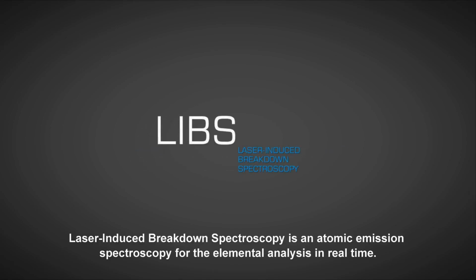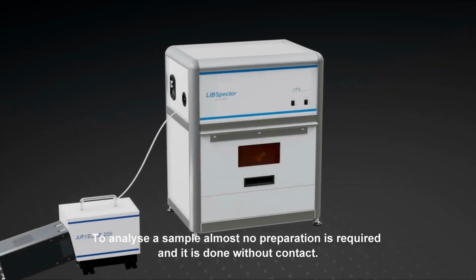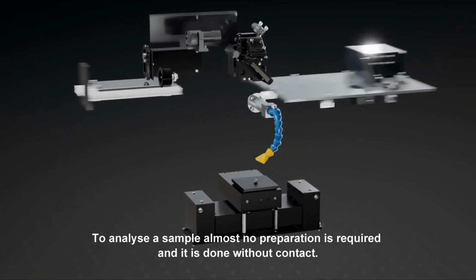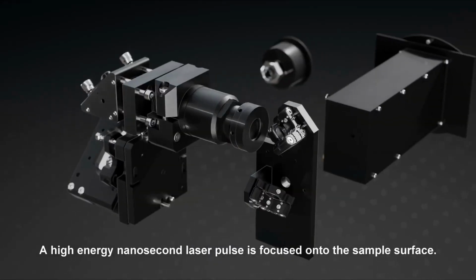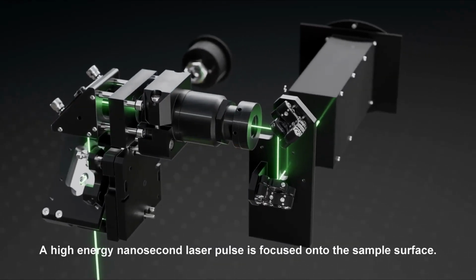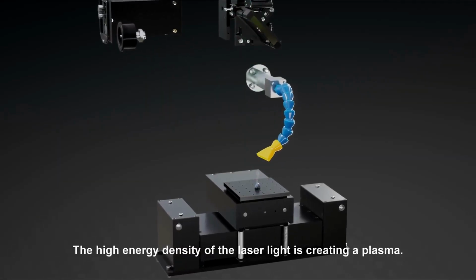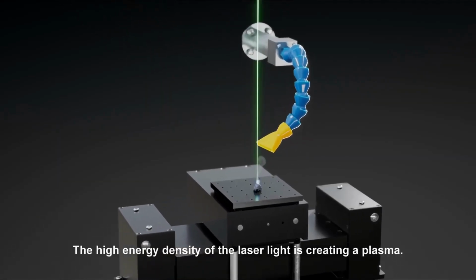Laser-induced breakdown spectroscopy is an atomic emission spectroscopy for elemental analysis in real time. To analyze a sample, almost no preparation is required, and it is done without contact. A high-energy nanosecond laser pulse is focused onto the sample surface. The high energy density of the laser light creates a plasma.